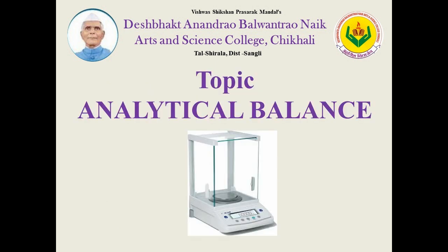Hello friends, today's topic is analytical balance. Analytical balances are instruments used for precisely determining the mass of matter. Analytical balances are sensitive and expensive instruments, and the accuracy of the analysis result depends upon their accuracy and precision.